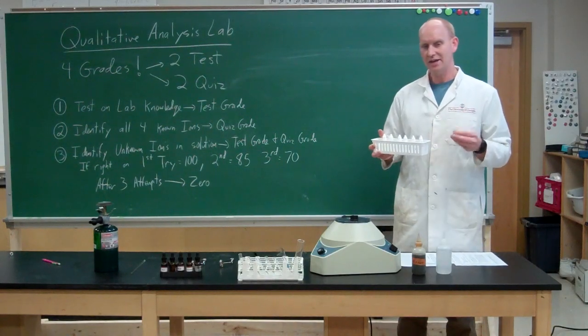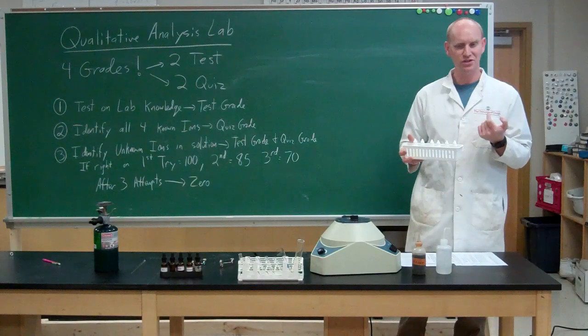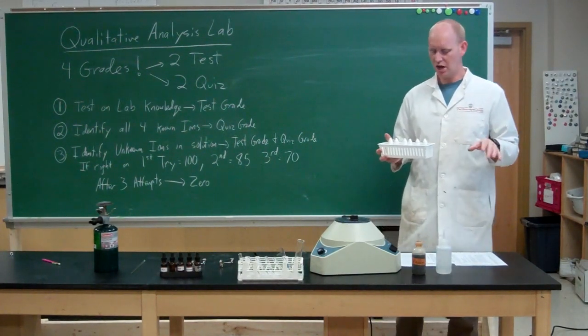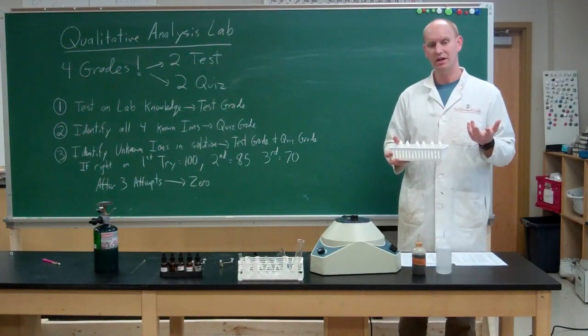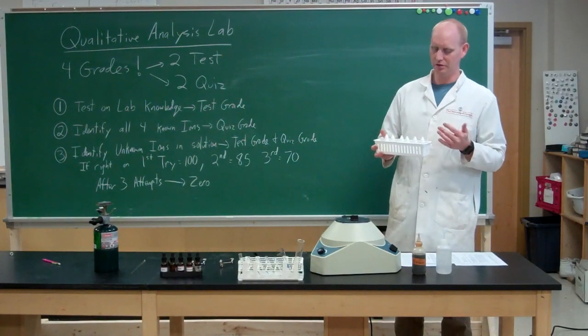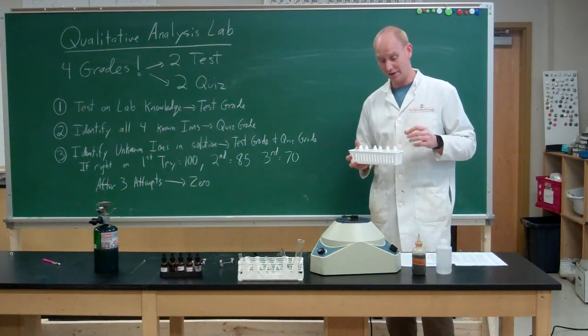The hydroxides are pretty basic, particularly your ammonium hydroxide, your sodium hydroxide. You don't want to get those on your skin. If you do, just wash it off. Your hydrochloric acid, your acetic acid, you don't want to get on your skin because it can cause some irritation. And nitric acid, you really don't want to get on your skin. And the sodium hypochlorite, you don't want to get on your skin or your clothes, it'll turn white.